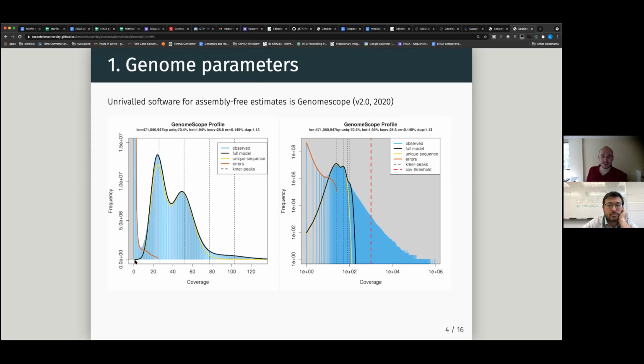It's going to try to fit a distribution for the diploid stuff, one distribution for the haploid stuff, and even a distribution down here for the 3-copy and the 4-copy stuff. So it's trying to iteratively fit these distributions.